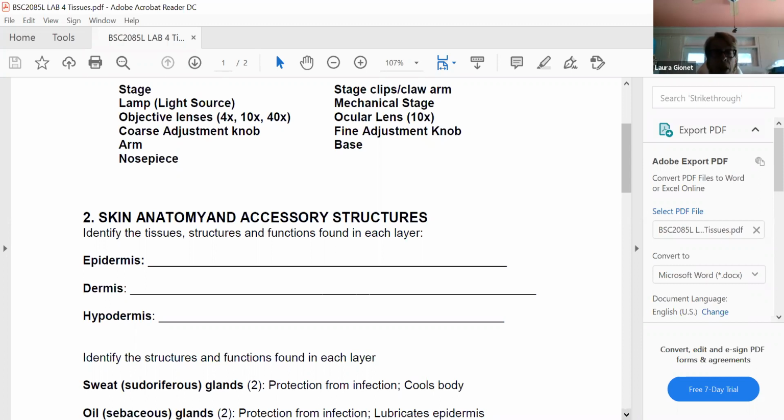So what are the main tissues there? Epidermis is stratified squamous epithelial tissue, or epithelium. In the dermis, we have 2 major tissues. The primary is dense irregular connective tissue, but we also find simple cuboidal epithelial tissue, because that is the type of tissue that would form the ducts and glands of sweat glands, as well as oil glands, but you'll especially see the sweat glands, often clustered by themselves, not adjacent to a hair follicle. And then the hypodermis, we have areolar connective tissue and adipose connective tissue. And that's what will be written in there.